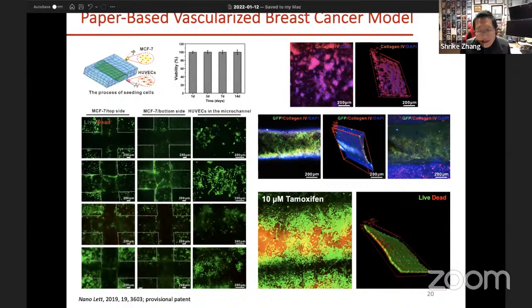So when you want to use them, you can actually autoclave these devices, and that gives you 2 things. One thing is that you can sterilize the whole device with autoclave, but also at the same time, because it's a water, vapor process, you can also wet the device to allow the bacterial cellulose to become swollen into this hydrogel device, and then you can start to really put cells in there again to create these, we call point of care organ chip devices, by directly putting cells in there at bedside, right?